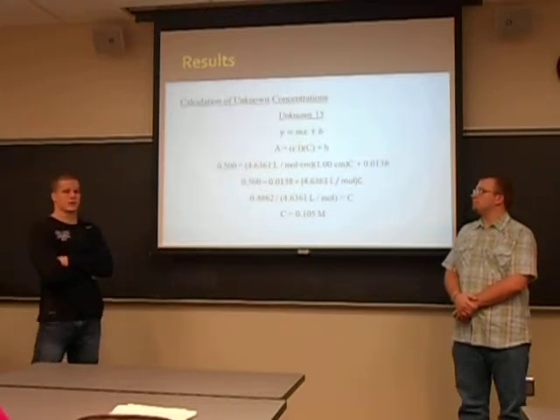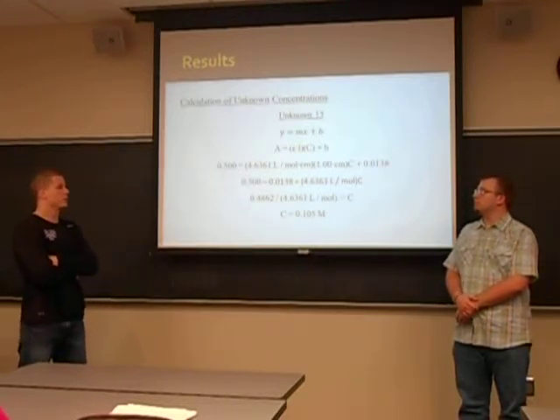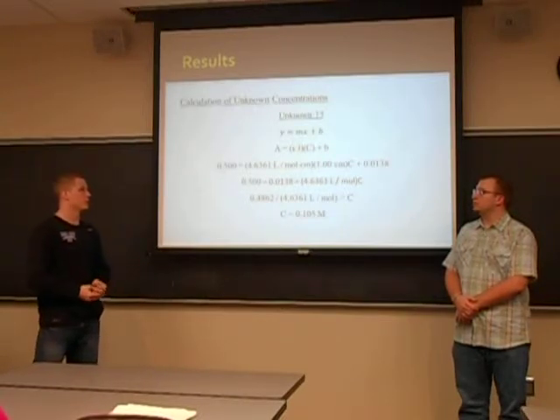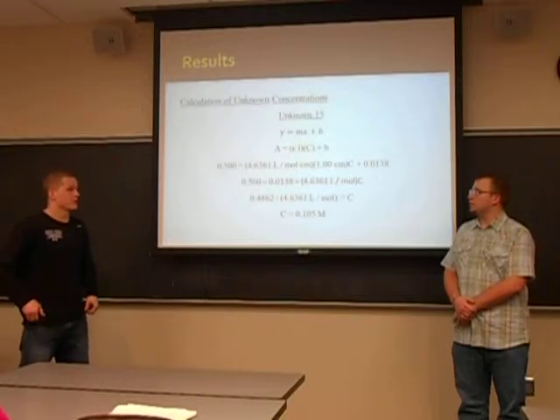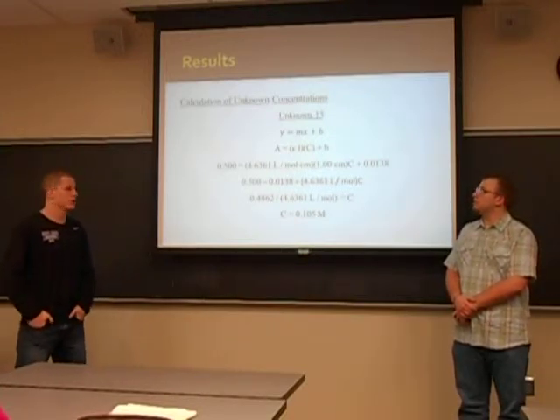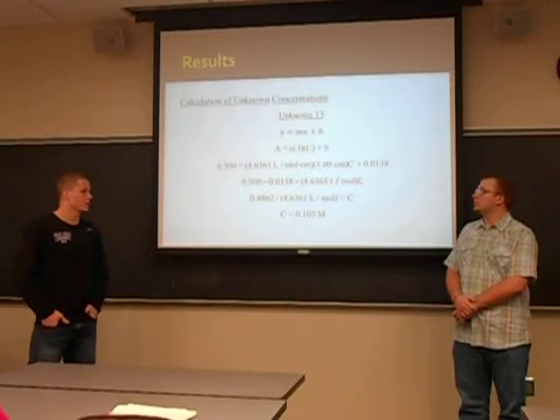We use y equals mx plus b from the standard line in our Excel. And we rearrange that to be absorbance equals epsilon times path length times concentration plus b. And just plug in our information off the Excel, we were able to get concentration to be 0.105 molarity.